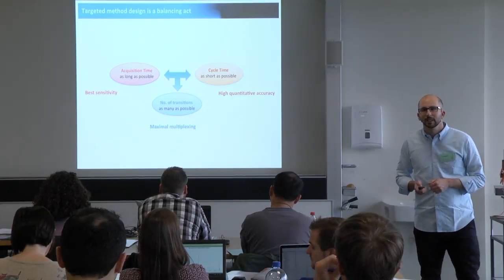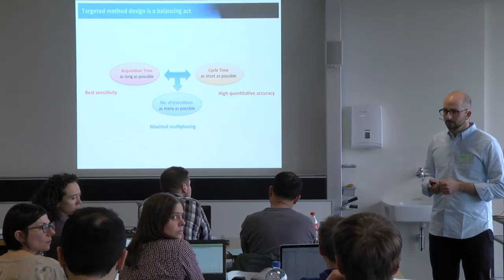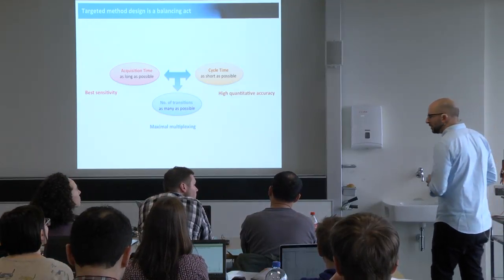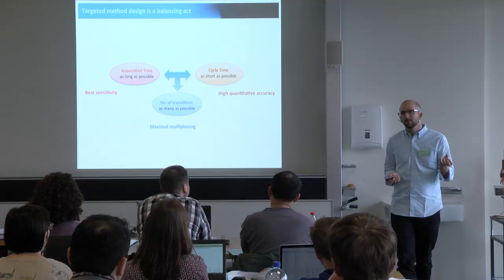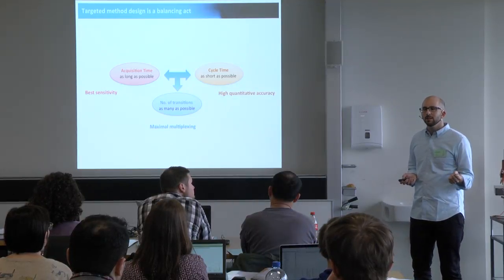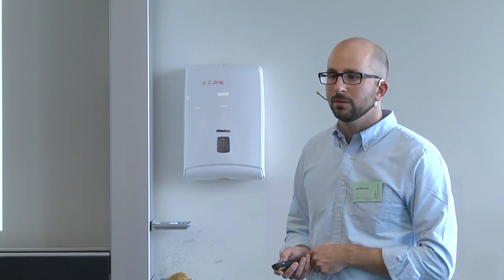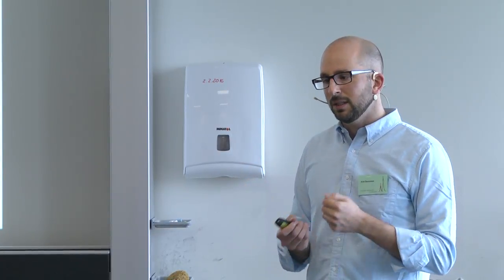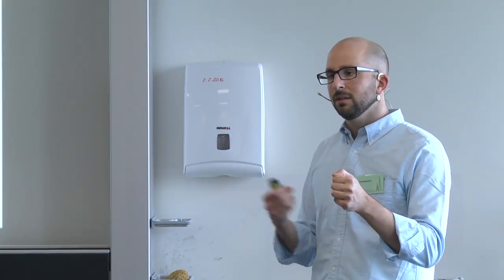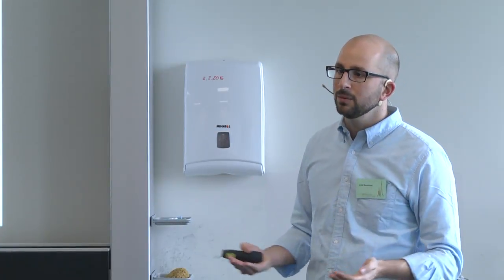Question? So why don't you normalize according to intensity? The dwell time? So I can repeat. The question was, why don't you normalize according to intensity? You do actually. So each machine, the data that comes out is normalized to intensity, but what is not is the number of points where you get an intensity. So if you only have 3 points, then at these 3 points, the data is actually normalized. The intensity that arrived at the detector is normalized to the dwell time. But if you only have 3 points, nothing will provide you with more points except actually measuring them. Is that clear?